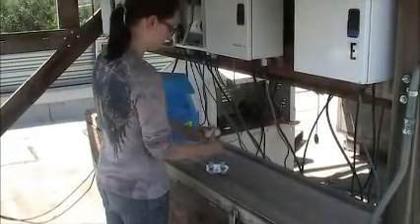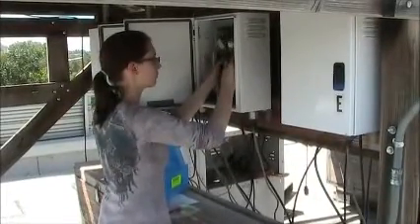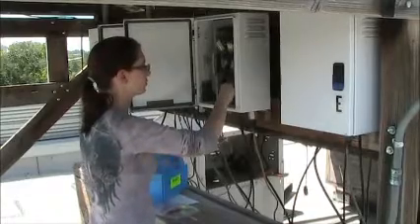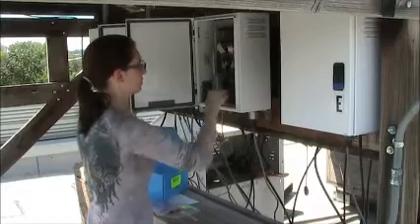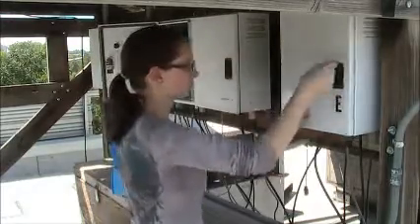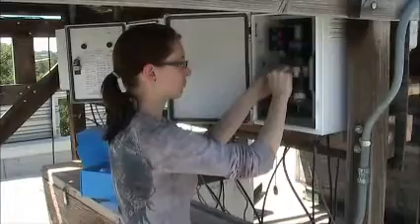Place the return label on the blue box that you will be shipping back. The return label will be found in the week 3 bag. Take out the week 1 cartridges and remove the red caps. Install the cartridges into their corresponding modules. Make sure to turn the D cartridge upside down and align it correctly when installing it.